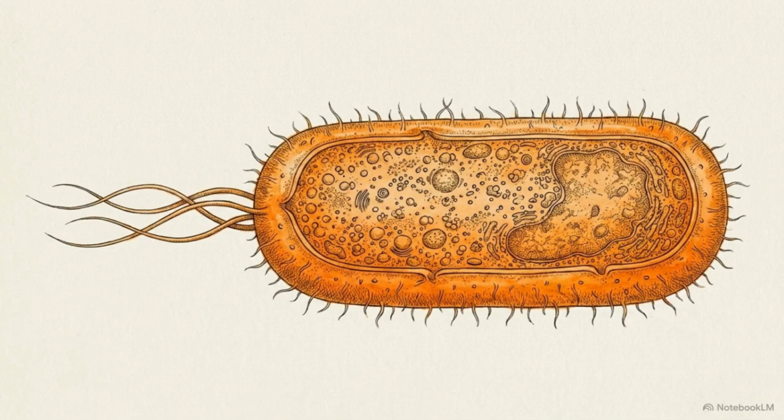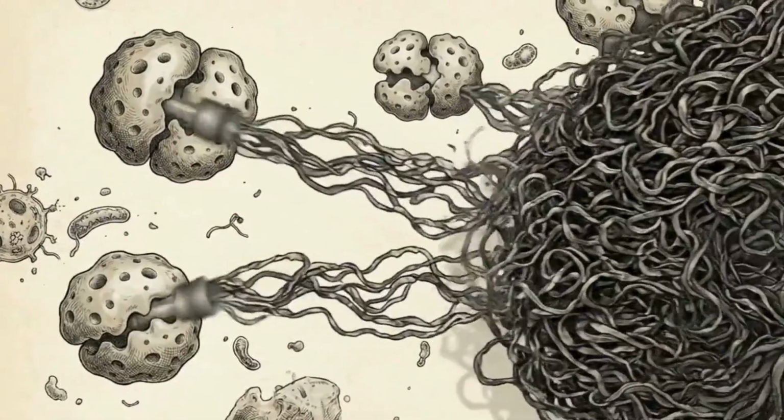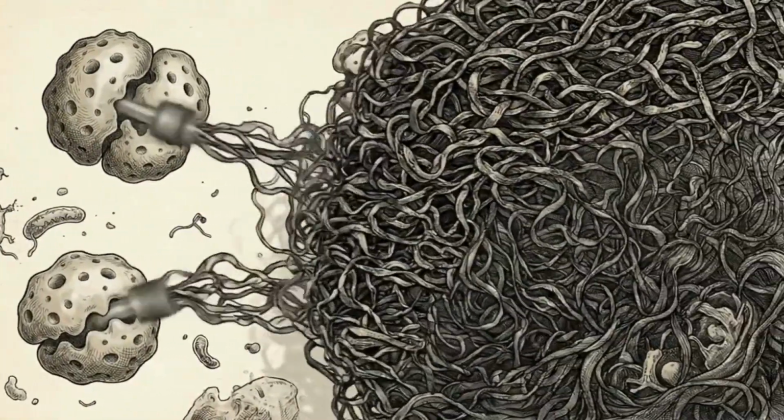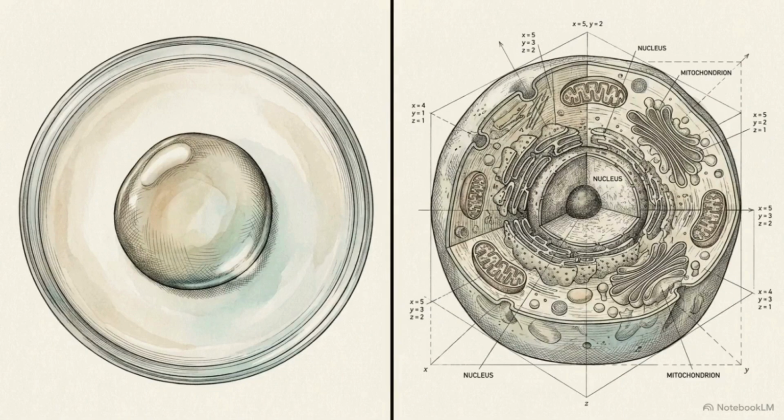But biological hosts resist being hijacked. Flooded with unfamiliar blueprints, the host cell often panics. Its folding machinery gets overwhelmed, misfolding the foreign proteins and dumping them into dense, useless clumps called inclusion bodies. Simple harvesting yields almost nothing. To get pristine material, scientists have to actively hack and debug the living factory.